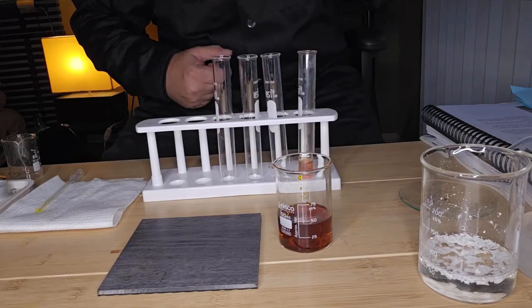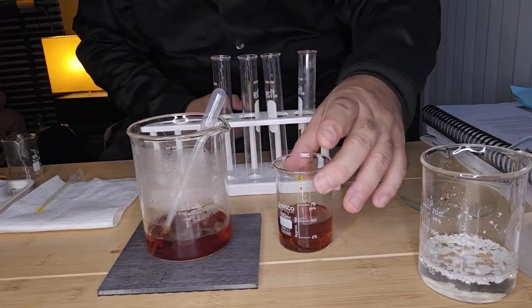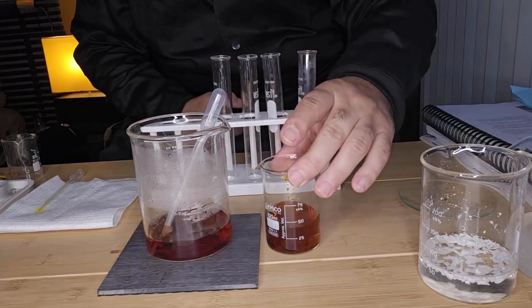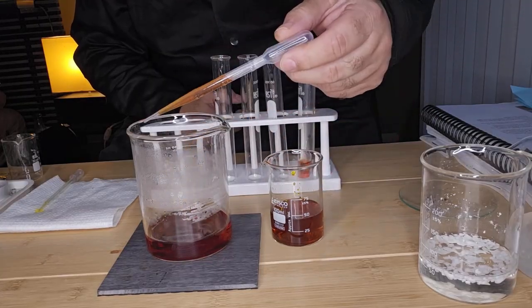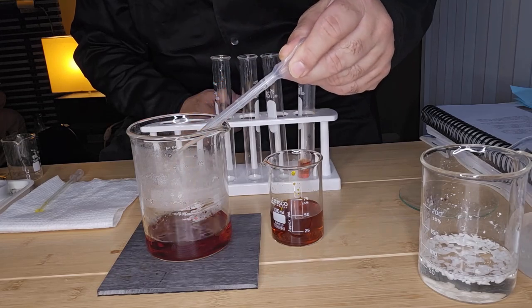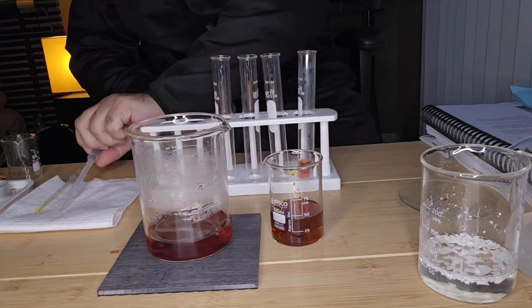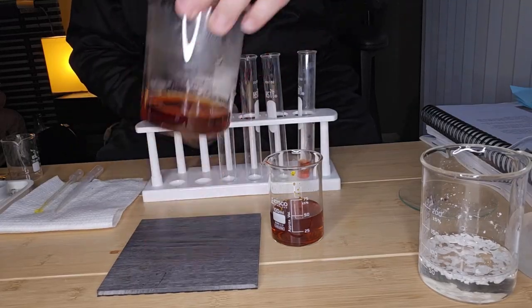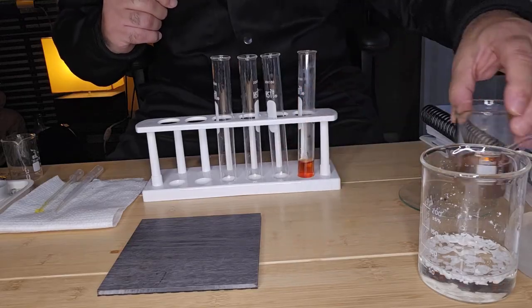If you compare the color of the original solution, remember the original solution was a yellowish brown. Now the sol is a reddish brown color. So there's been a color change, indicating a new substance formed.